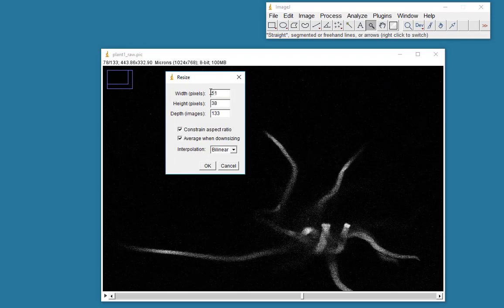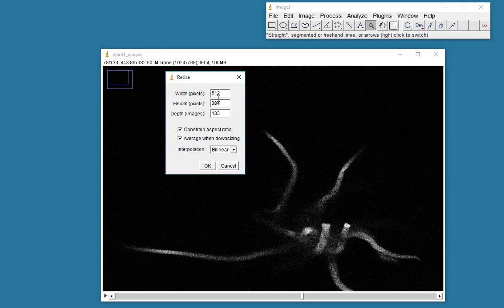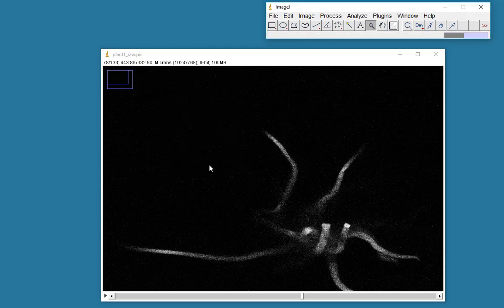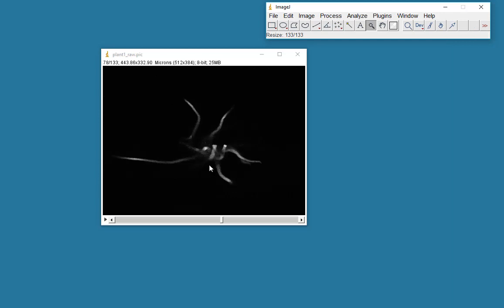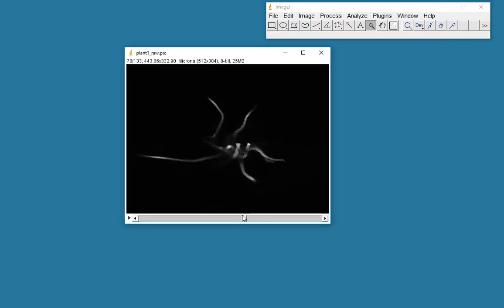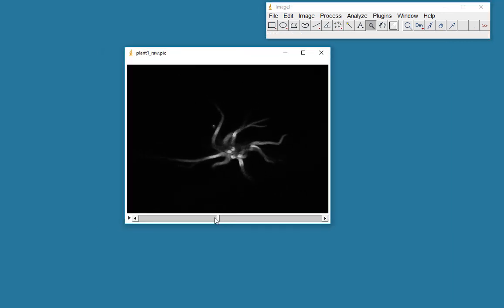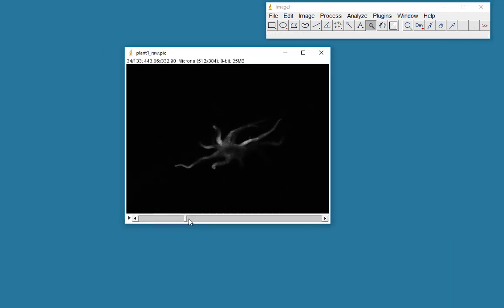I'm constraining the aspect ratio so that the height stays proportional to the change in width. You'll see that the depth is 133, which means there are 133 images in the stack. So I've resized those and here's my data set.